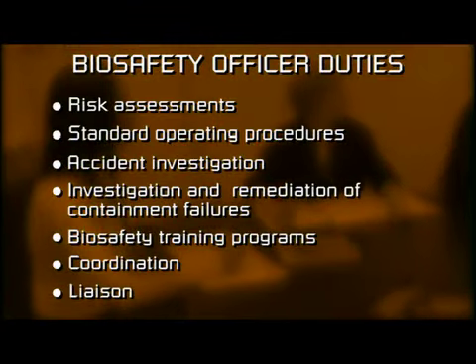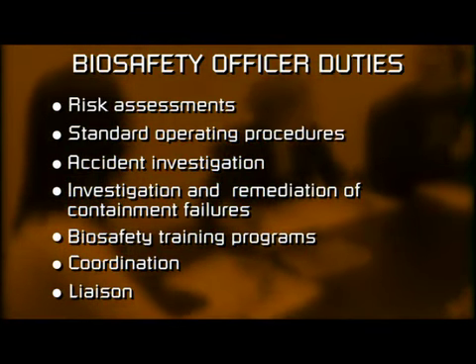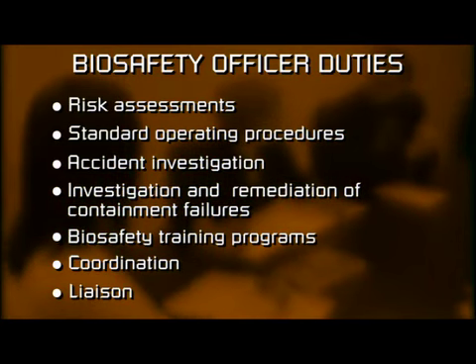Biosafety is an important component of laboratory operations. The biosafety officer's duties are to manage these issues, which can include performing risk assessments to determine the lab's appropriate containment level and reviewing standard operating procedures, or SOP for short, that are specific to the lab's activities.